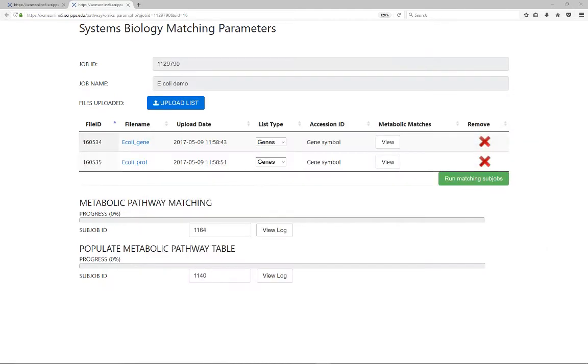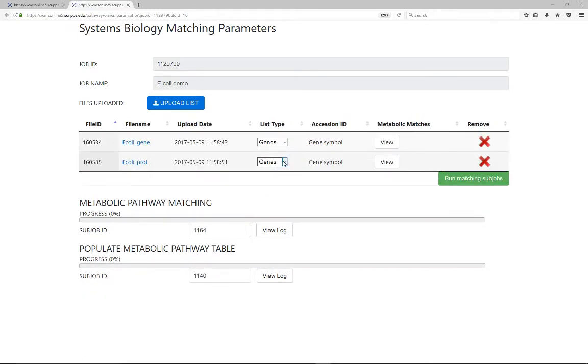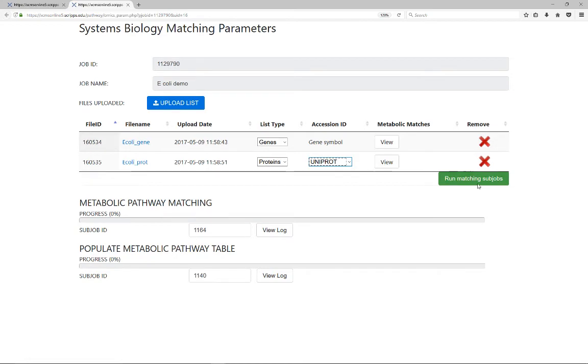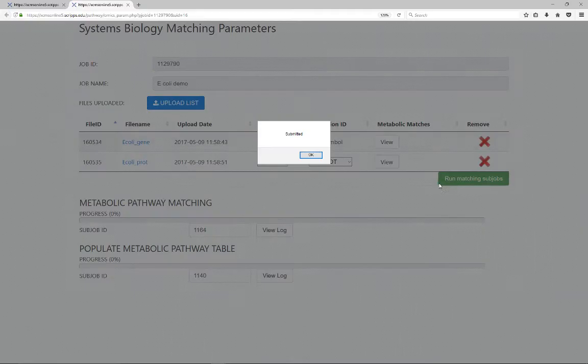On the main window, select whether the file is a gene or protein list from the drop-down box. If the file type is a protein list, ensure the correct accession ID format is also selected. Once all the parameters have been confirmed, click Run Matching Subjob. The progress bar will show 100% when the job is complete.